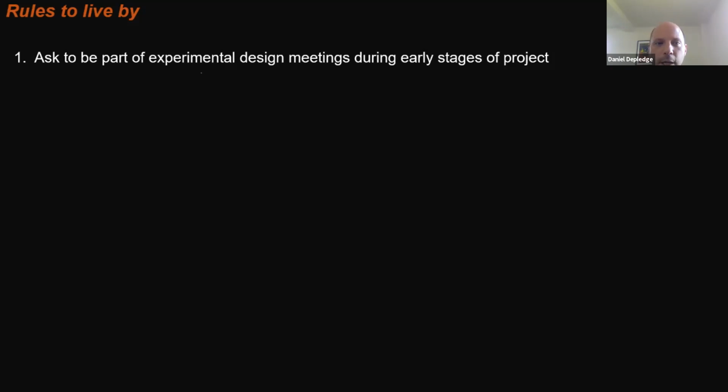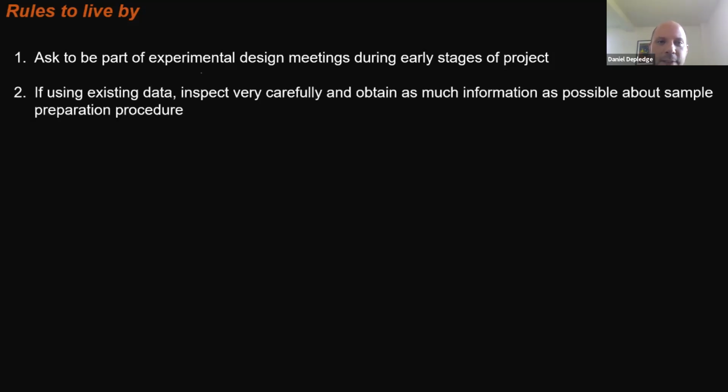There's nothing worse than blowing 20K on a sequencing experiment and then having an informatician tell you, well, you can't answer the question you want with this data, you should have done it this way. And I've been in those situations and people are very upset when you tell them you've wasted money.